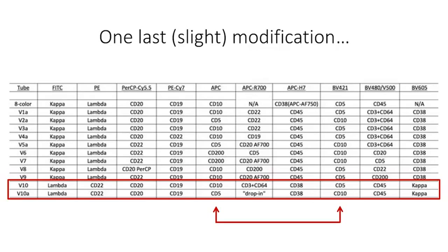We've already got a lot of gating reagents in the tube now, CD19, CD22. And so, frankly, without relying on a dump channel, we can get a very clean signal focusing just on B cells. And ultimately, we felt it would be better to leave that channel empty, and if someone had an application for which they could use it, that would leave the tube a little more flexible. But we felt that the backbone that we had was pretty solid.